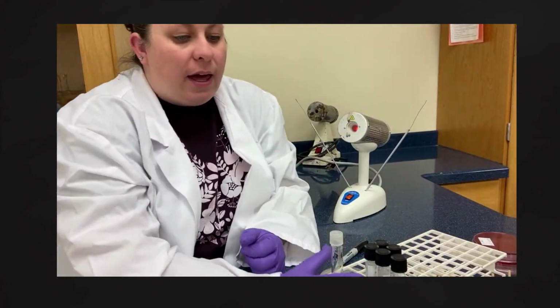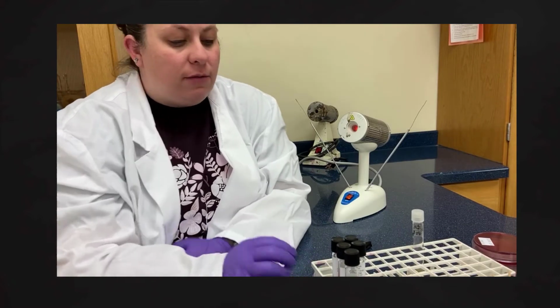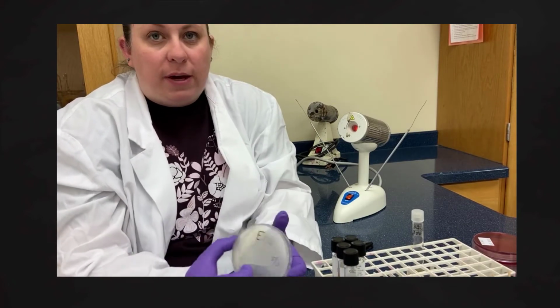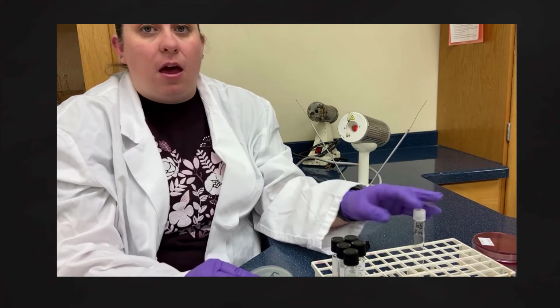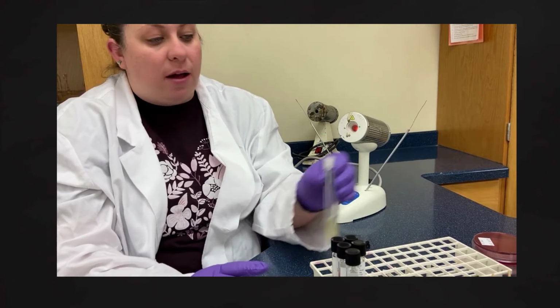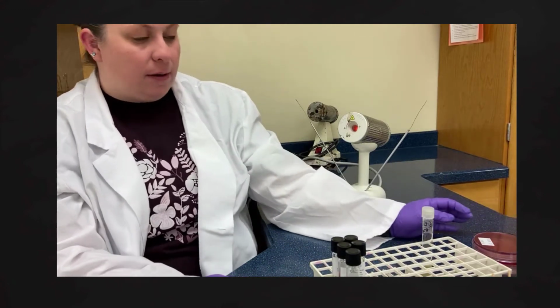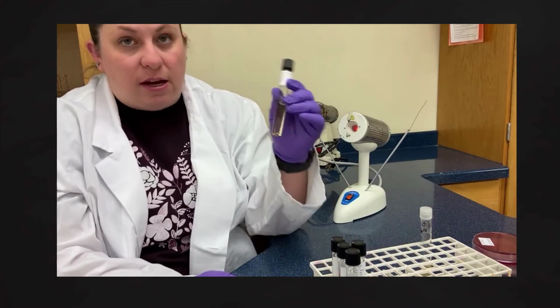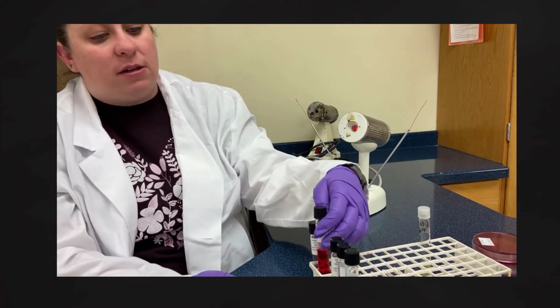Now, when we're looking at our broths and our different types of slants and such, a lot of times we're going to pull bacteria off of a plate instead of pulling it out of a broth we already had. So with this, I have an E. coli plate here, and I'm going to use this. Now I'm going to do the broths first. So I have 2 broths here. These broths are a little bit different.